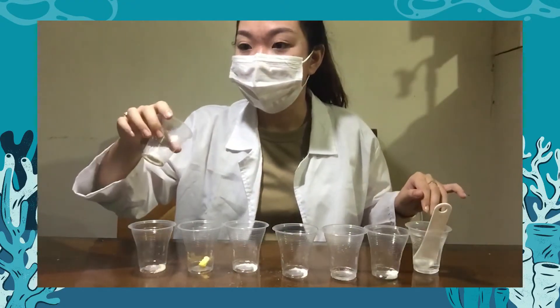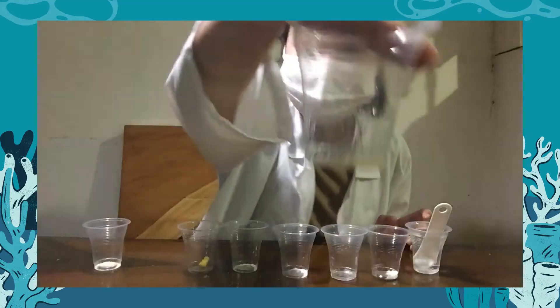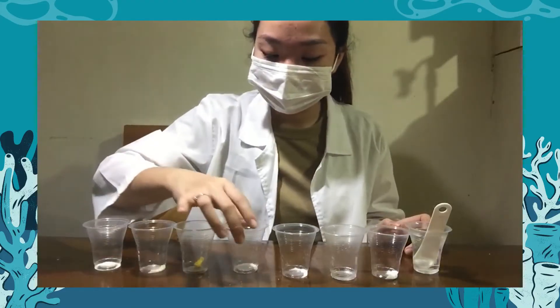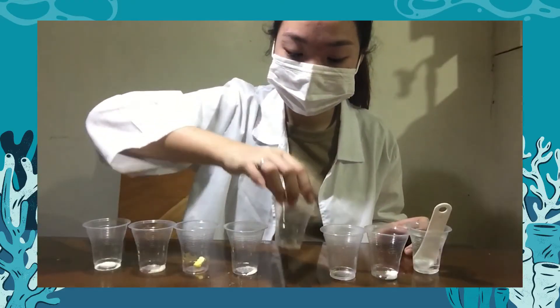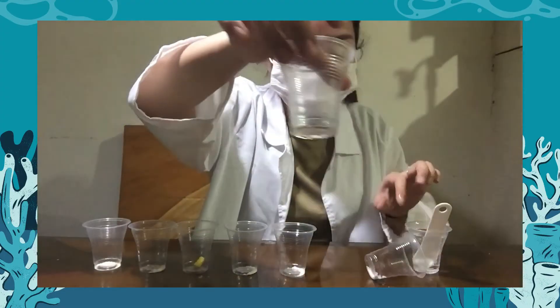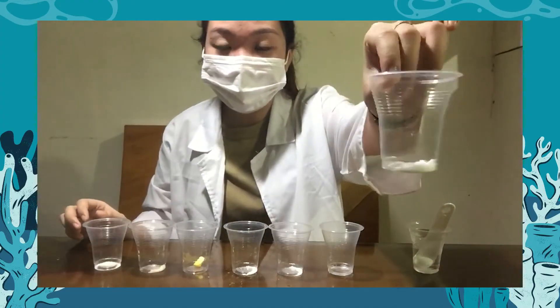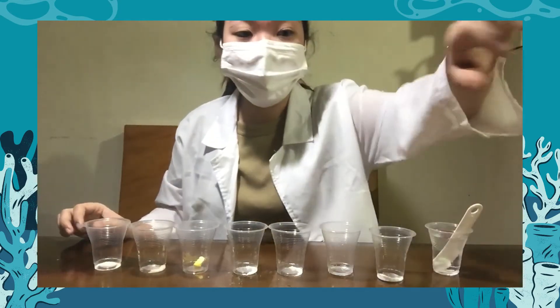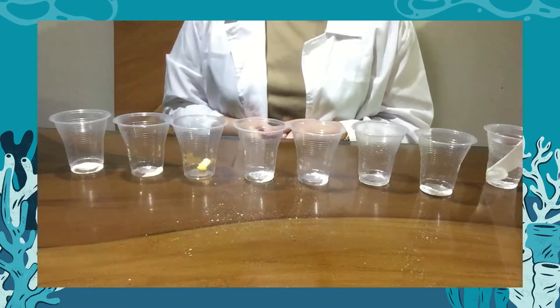We need citric acid powder, sugar, margarine, gelatin powder, sodium chloride or table salt, ethanol, baking soda or sodium bicarbonate, water, and acetone. So, water as a universal solvent.